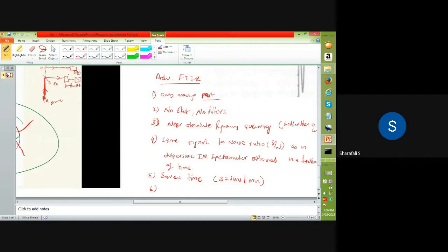So in this case, what will happen? I am just roughly drawing these things. If you are considering this kind of technique, then we have the original spectra here, and we have the spectra which is coming through the sample here. Now if you are analyzing and comparing these two, you can see some things which are missing.